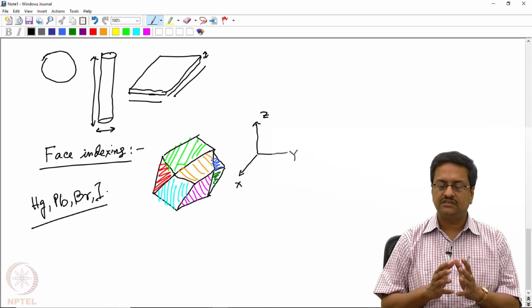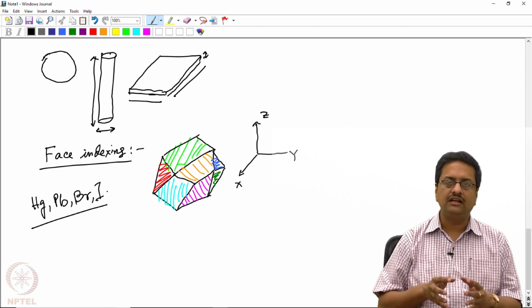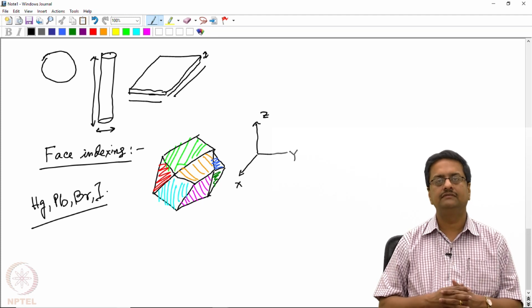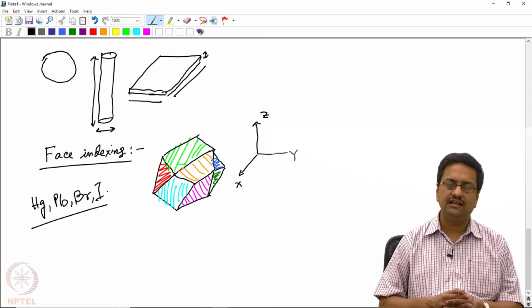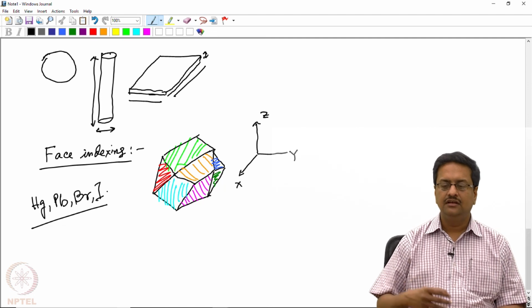So the absorption correction is important, but it is minimized by using a lower wavelength source like a molybdenum source. By choosing a crystal of appropriate shape and size, one can reduce the effects of absorption.